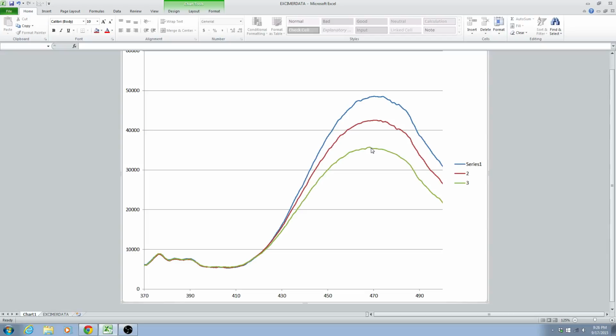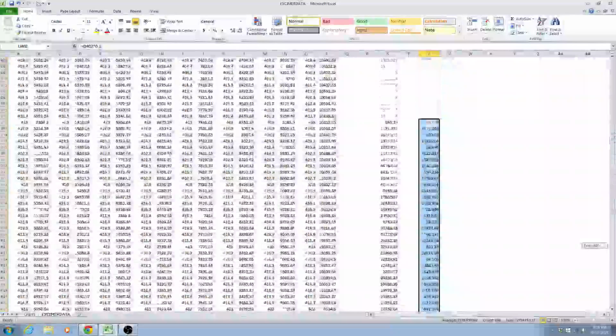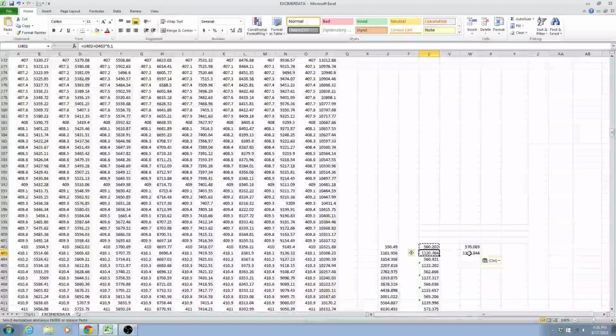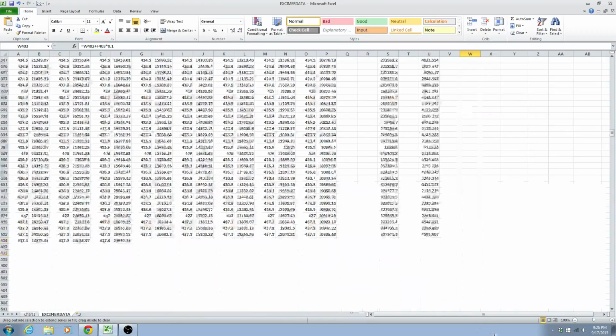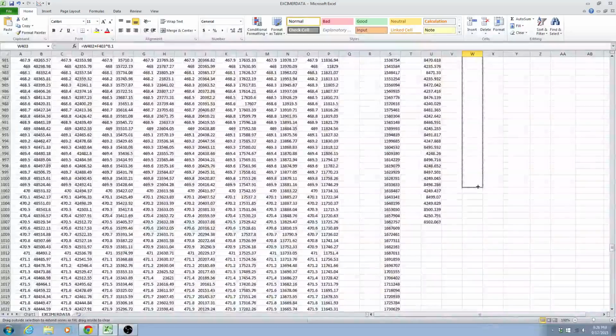The peak is 469, I guess. So just do the same thing. I don't know why it's acting up there. Take it down to 469. Never mind, 469, that's it.